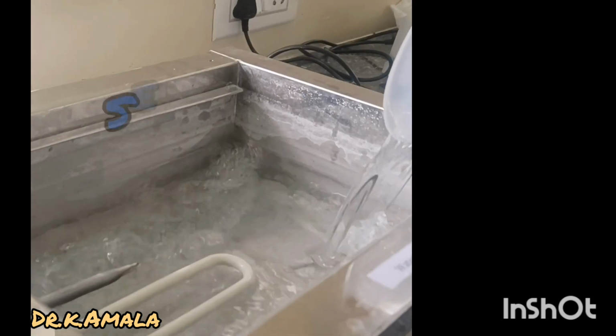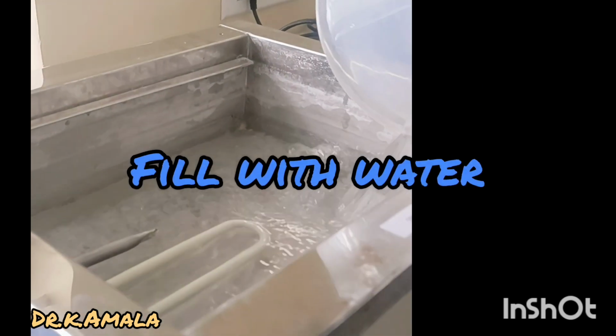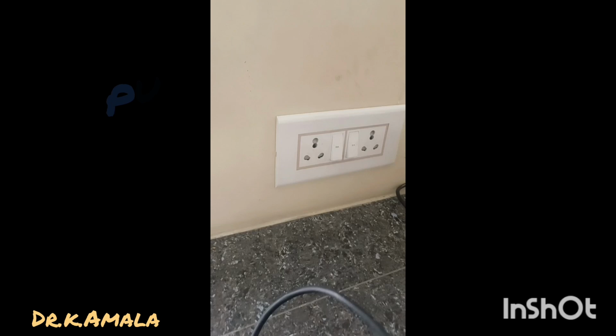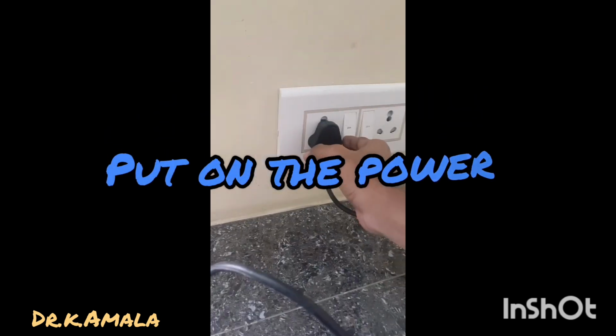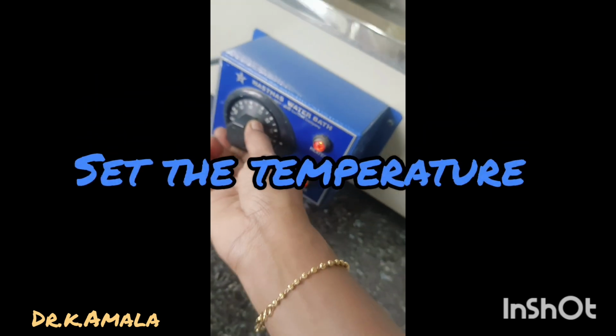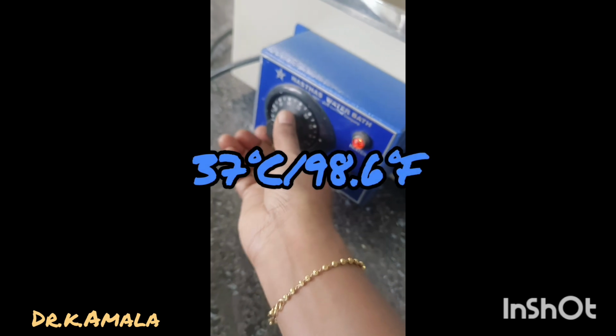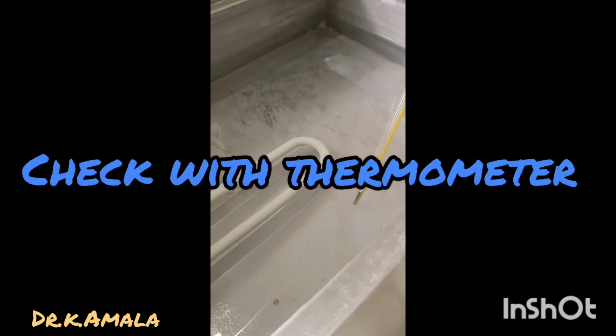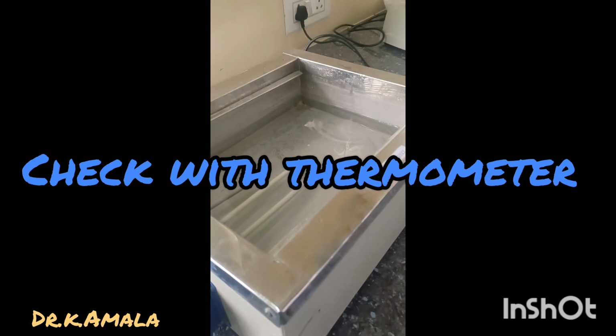Set the water bath and pour water. Put on the power switch. Set the temperature to 37 degrees Celsius or 98.6 degrees Fahrenheit for 30 minutes. Check the temperature with a thermometer.